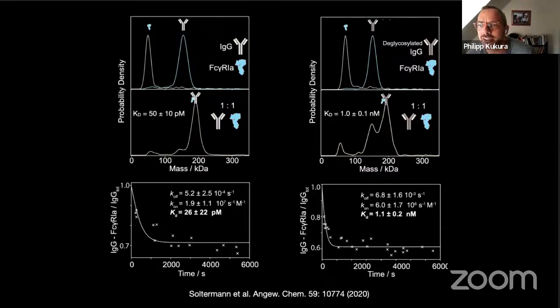I've got a question here. Proteins are flexible depending on the environment, hence the effective volume. As here density is taken to be constant, how do you use the calibration to detect the same protein in a different solvent environment, where the effective volume could be different due to different flexibility and partial denaturation? Right, so this is a tricky question.